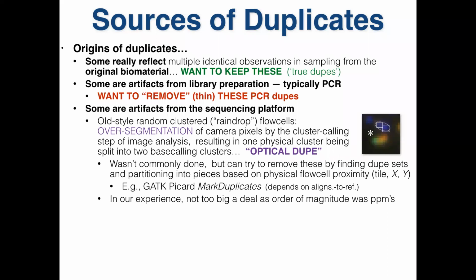I didn't finish that discussion. We talked about the all versus all comparison. Well, if you do have alignments to reference, that simplifies your life a lot, because then you don't have to compare all to all. You just walk along the genome and take all the reads that are in a little vicinity around where you are in the genome. That's your candidate for comparing it. You don't have to do all of it. Things that map nearby on the genome. Right? You go from a billion by a billion columns to lots of little dozen by dozen columns.